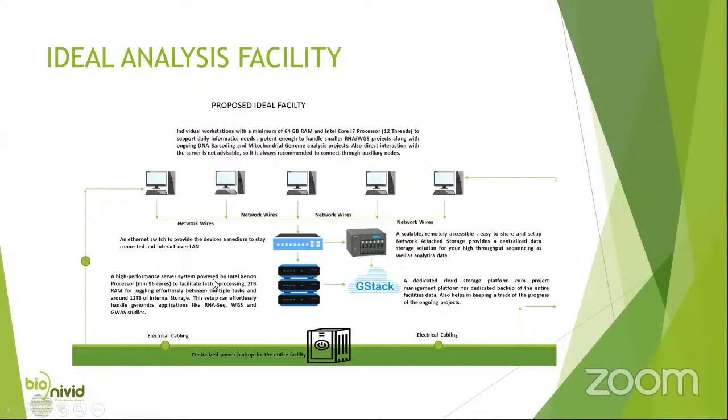to process a de novo genome, then the amount of RAM required, the RAM that you have in your system becomes quite important. So if I give you a straightforward calculation, 1 GB of RAM is required to process 1 million reads. That is a straightforward calculation here. So whatever is the amount of reads that you are looking to generate, you can contemplate based on this stat. So for de novo experiments I'm talking about, you'll require a heavy RAM setup when you are looking to analyze eukaryotic genomes. Even bacterial genomes also, if you are looking to assemble, you need to have a minimum 128 GB RAM setup.